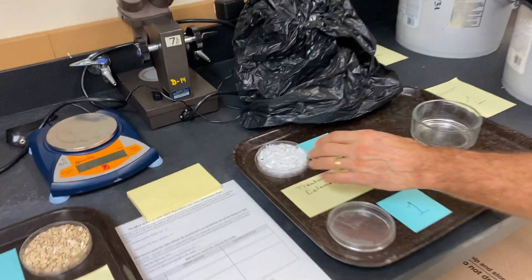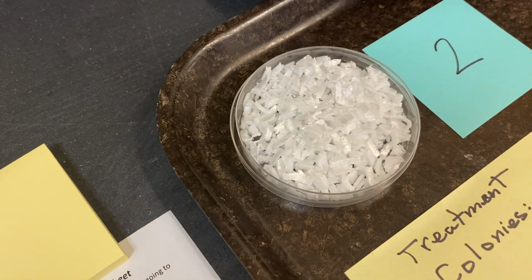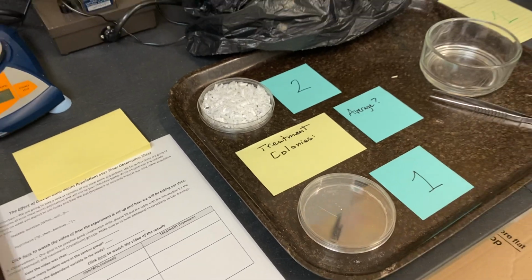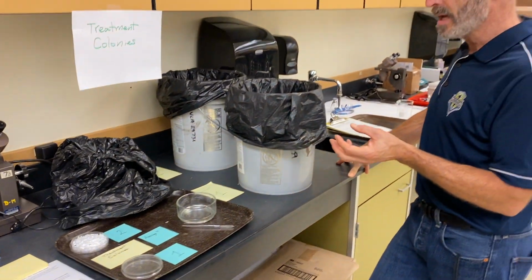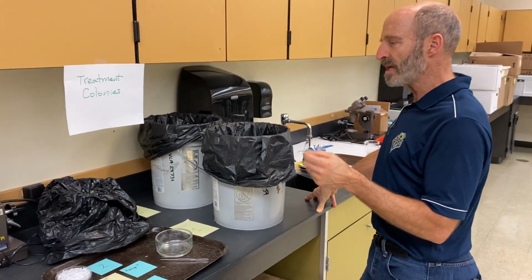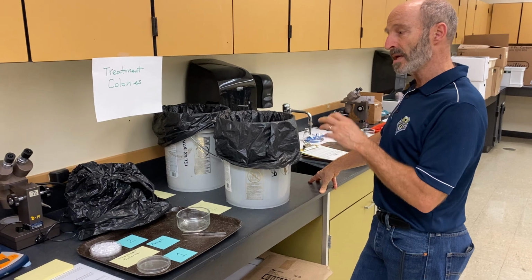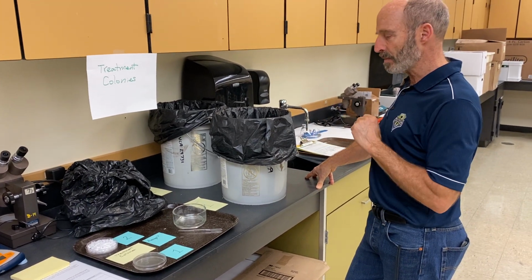So what we are doing is we're doing a confirmatory study in this class in which we are following up on some recent research to suggest that mealworms will in fact somehow extract energy from styrofoam that allows them to carry on and complete their life cycle. What we want to know is, is that really true? And if it is, are there any differences between these populations?